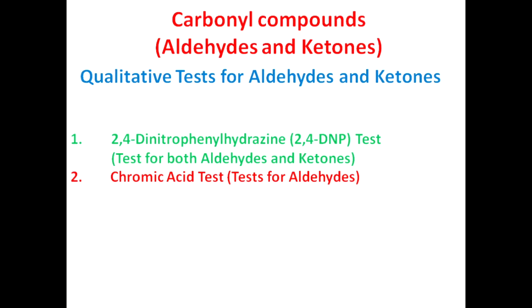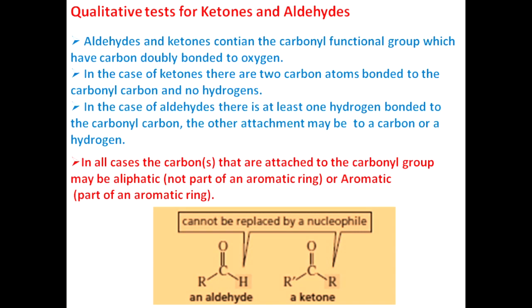As we know, aldehyde and ketone are different. Aldehyde is a functional group with a carbonyl group and one hydrogen, and ketone is a carbonyl group with two alkyl groups. So both will react differently. That's why these tests will confirm the presence of either aldehyde or ketone. So now, what are the qualitative tests?